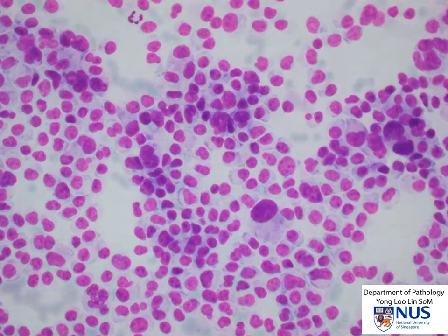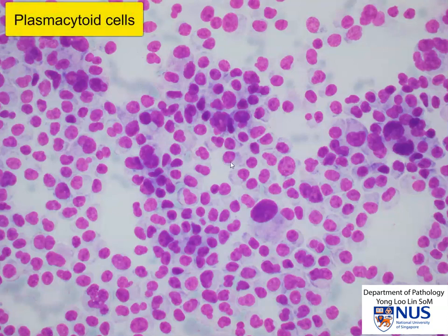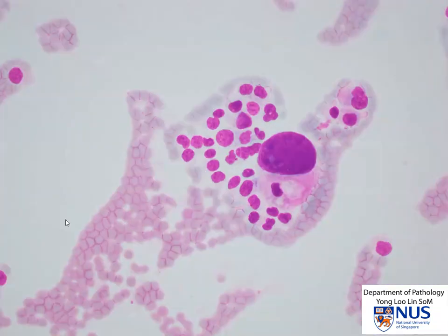At higher magnification, as we focus up and down, we can actually see that the cells are quite plasmacytoid with eccentric rounded nuclei and moderately abundant pale cytoplasm. Here is another example of a very large and bizarre cell.